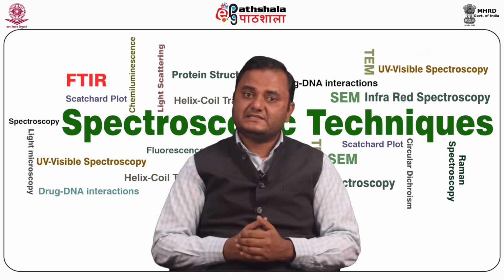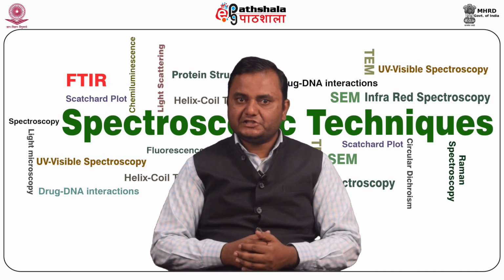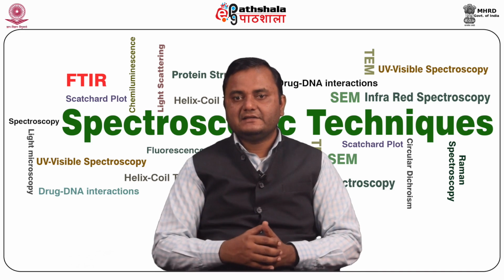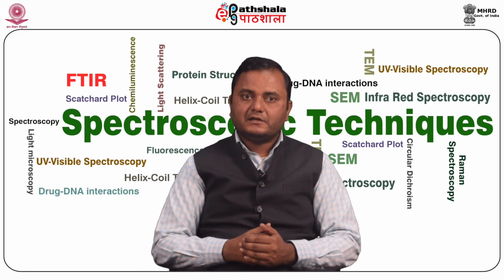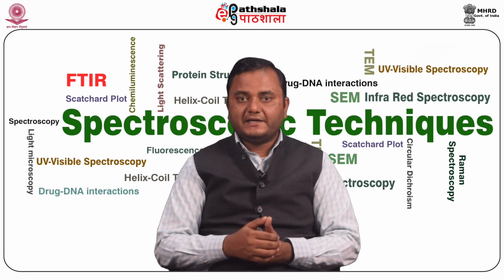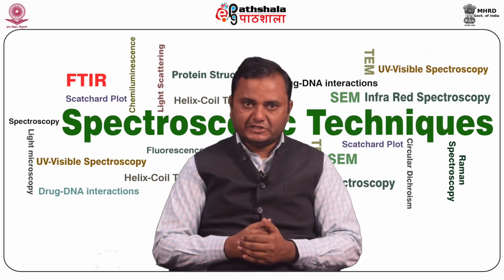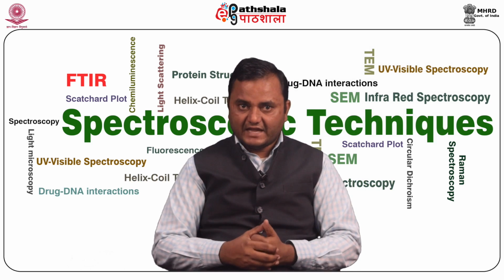The fourth advantage is better sensitivity. In the interferometer, the radiation power transmitted onto the detector is very high, which results in high sensitivity. That allows simultaneous measurement over the entire wavelength range. The fifth advantage is no stray light in the FTIR.